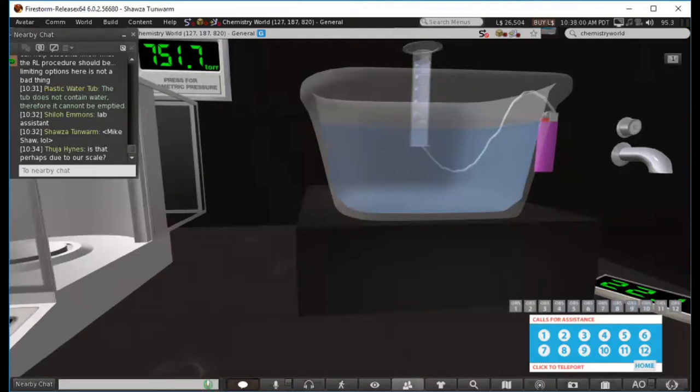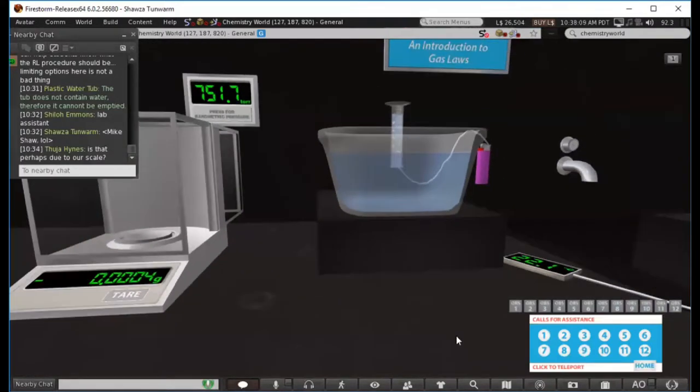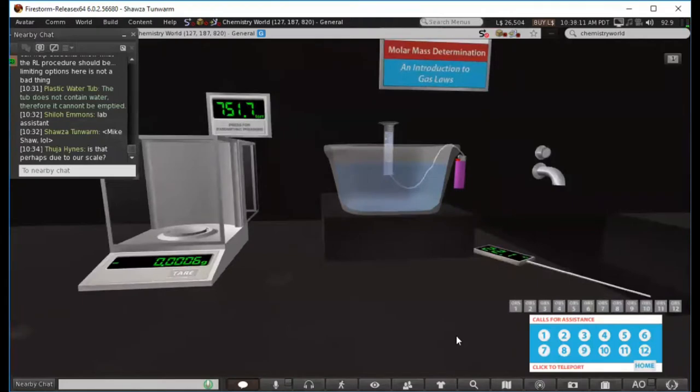So they can measure a volume of butane gas. They measure the mass of the lighter afterwards, and there's a change in the mass because some of the butane gas has leaked out of it. And from the difference in mass and the volume of gas they collect, they can figure out, again, the molar mass of butane. So they have to do several trials and so forth. So that's fundamentally what the students have to do, and that's what they had to do for the lab practicum.